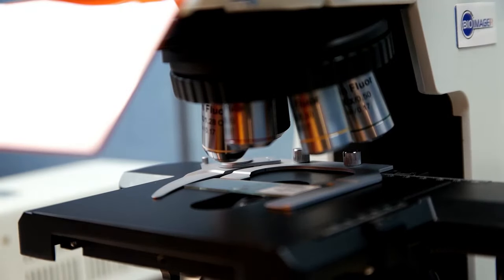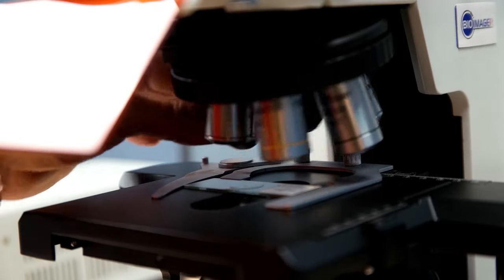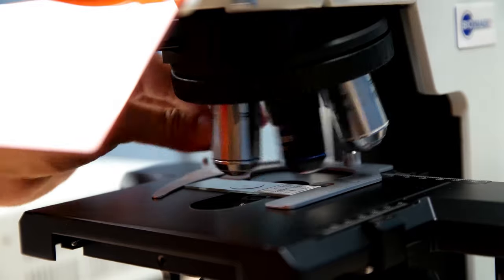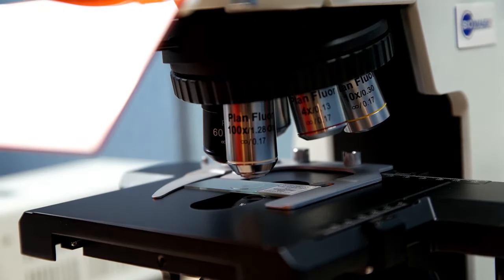This microscope by default has 4x, 10x, 20x, 40x, and 100x objective lenses, the 100x being oil immersion.